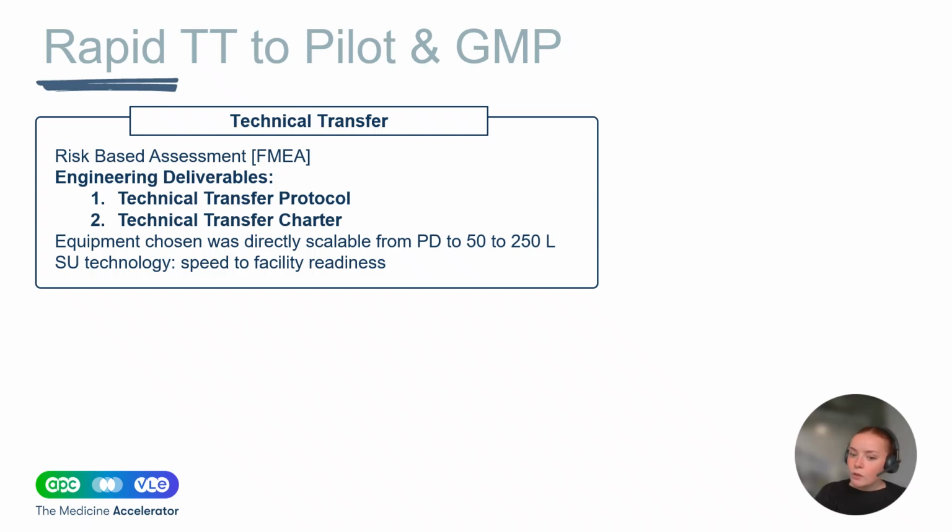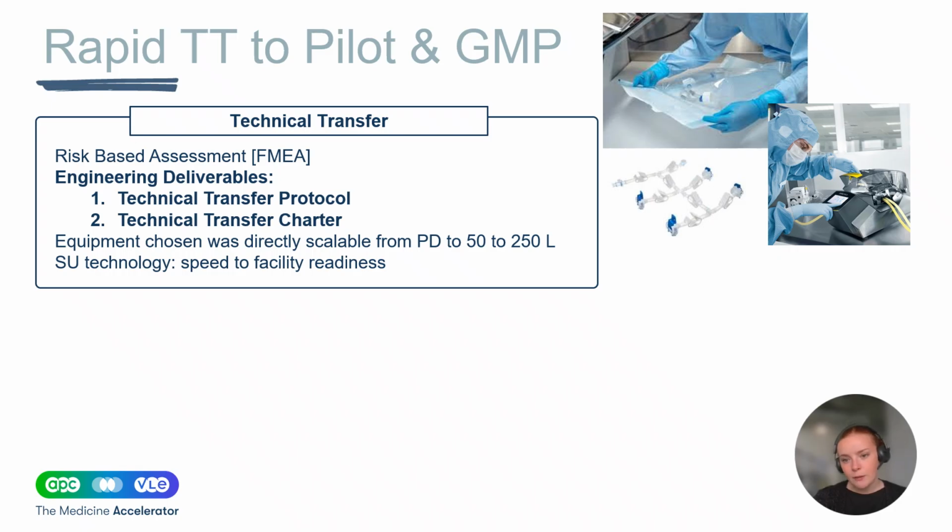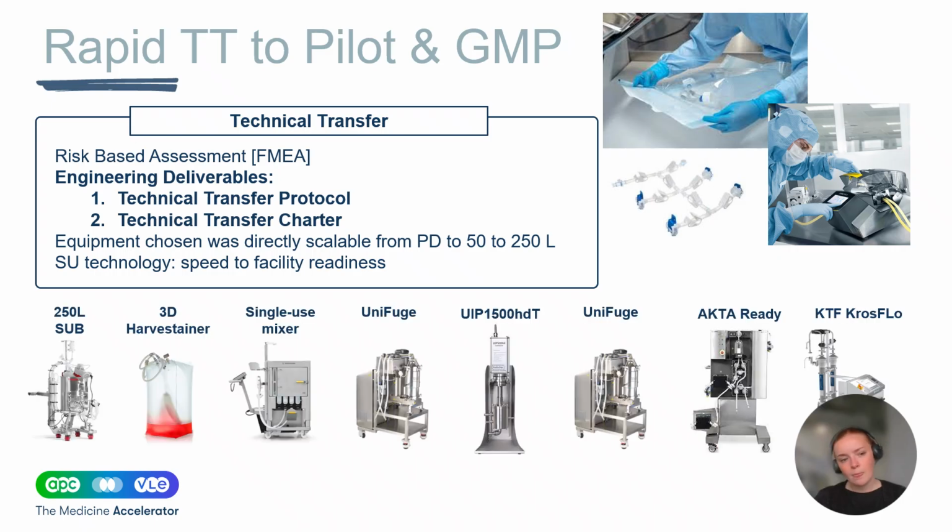And because we chose our GMP-able single-use tubing and materials and raw materials from the very beginning, that meant that we didn't have a lot of roadblocks from that sense. This process was completely single-use. These are images taken online, but we have aseptic quick manifolds with clamps. We used welders and sealers if we couldn't use our aseptic quicks, as our backup. And then we also would have used some autoclaving as well.